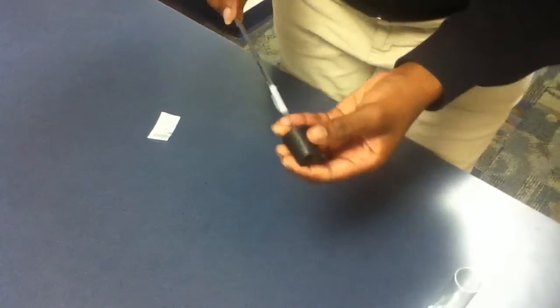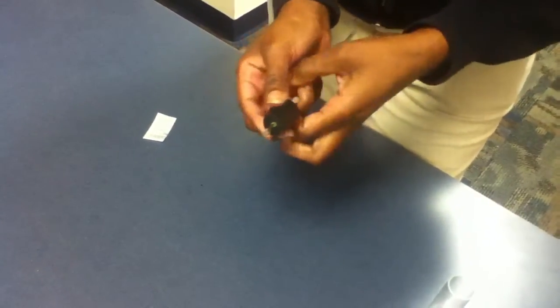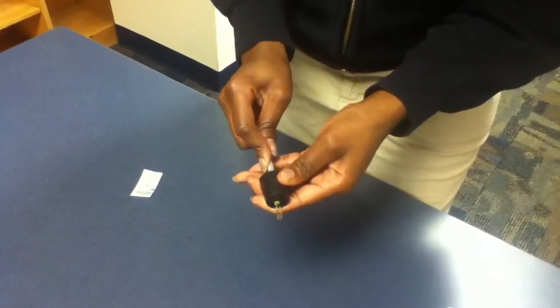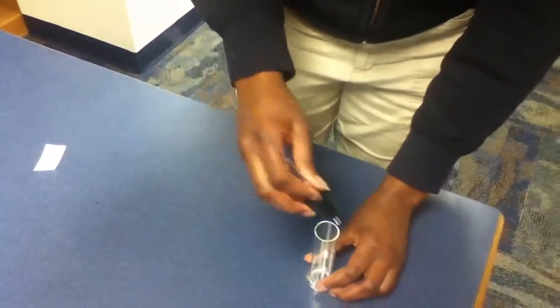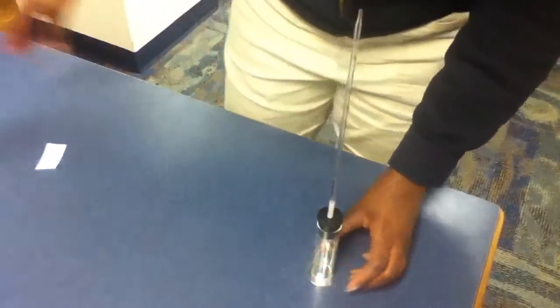Next, take the stopper and put the pipette through the stopper. Push it down, then take the pipette and the stopper and push it down into the glass cylinder.